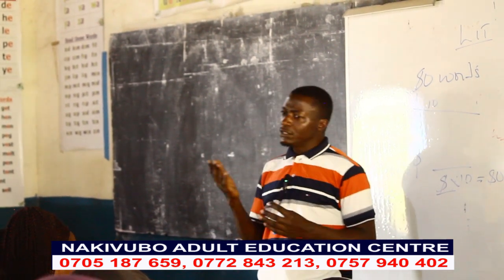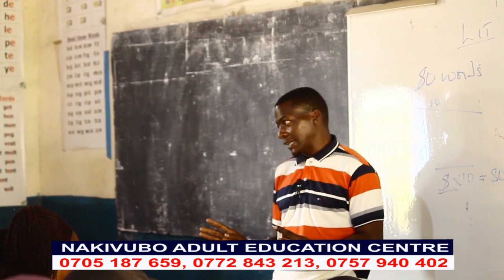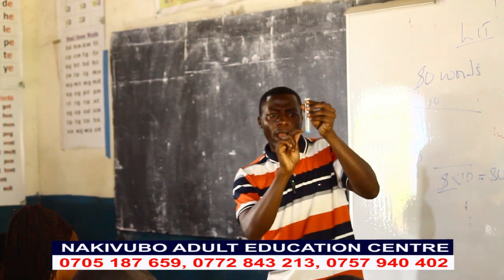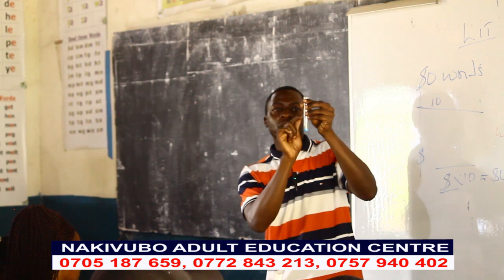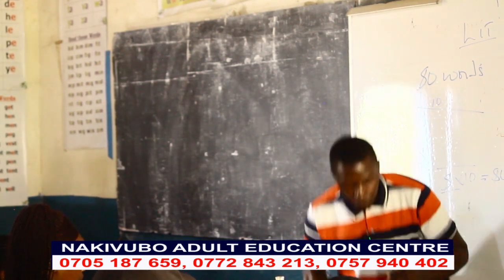Number two, someone may ask for a measuring cylinder. Okay, they have told me to measure 5. Where's the measuring cylinder? Then you don't have it, and you are stuck. No, you can just estimate. You understand? So you can estimate maybe 1 cubic centimeter can be around here. Now, if it is 5, could be maybe 1, 2, 3. You can try to estimate.